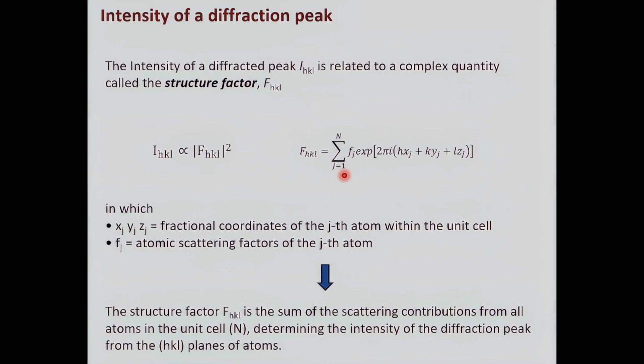You can see that there is a summation over all the atoms in the unit cell. This means that all the atoms in the family of planes characterized by these HKL values contribute to the intensity.